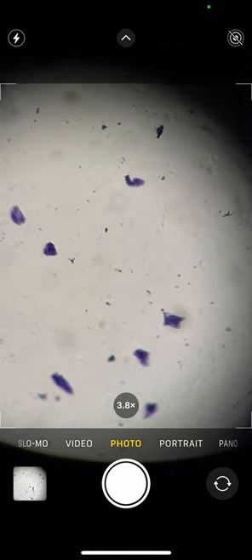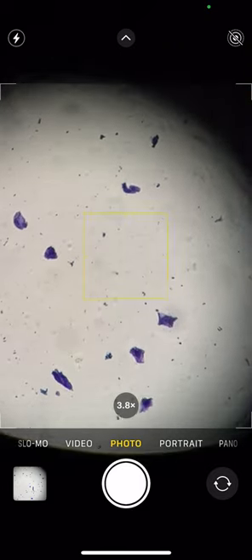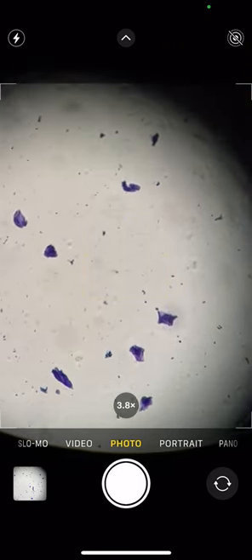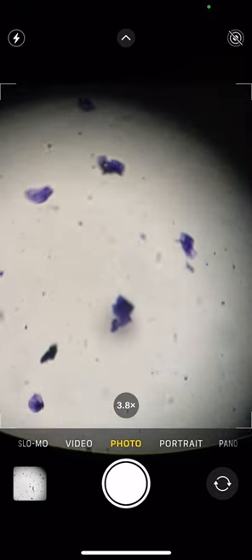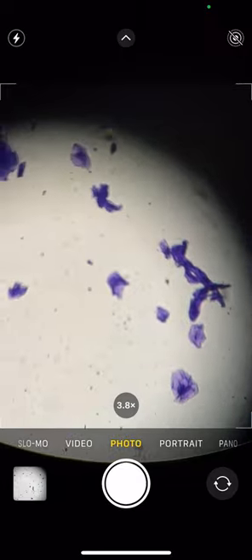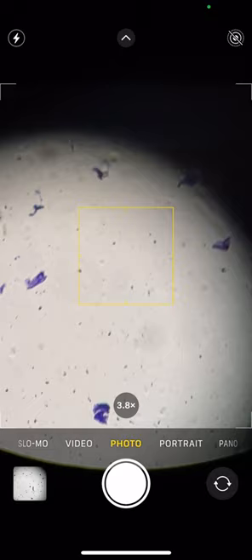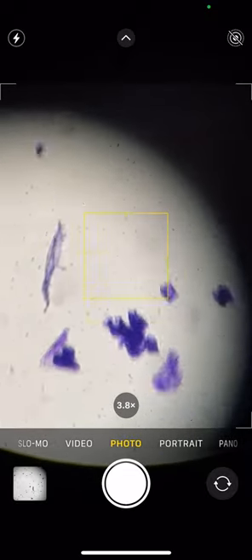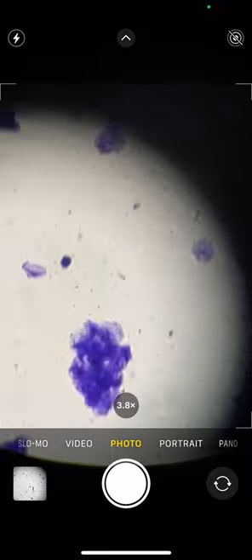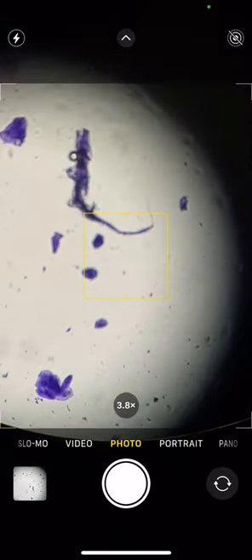So I moved up to low power. See all these clusters of cells. Kind of look at all the ones you can see. That's what I was looking for.